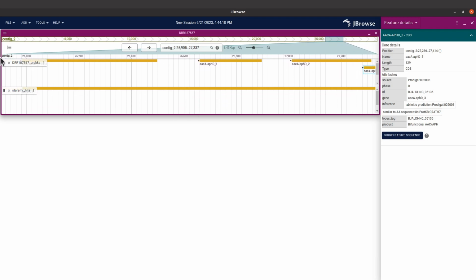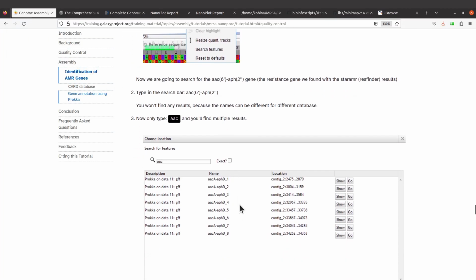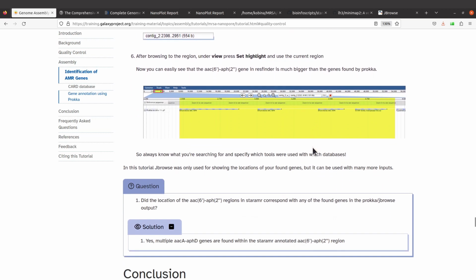All right, so in the Galaxy tutorial page, for the Galaxy tutorial page, they had, let's say the number here is, I think, it's 5. Let's say 1, 2, 3, 4, 5, 6, 7, 8. Let's check the number. I think I saw the number somewhere here. I'll just check.